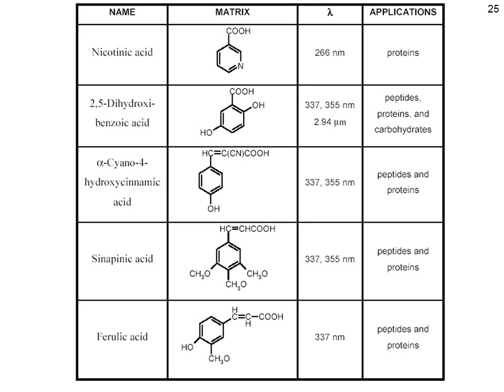As indicated by the name matrix-assisted laser desorption ionization, there is a need for a matrix to help in the ionization. Matrix molecules have two principal characteristics. One is an aromatic system to absorb the laser light, and second, a carboxylic acid group to help in the ionization by transferring a proton.